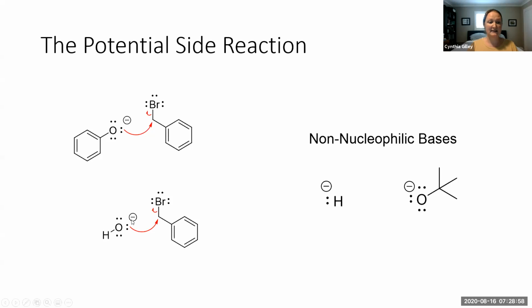So in this particular case, it's not going to be a significant side reaction, but had you added a lot of excess hydroxide, it potentially could be a side reaction, because the Williamson ether reaction itself is a slow reaction. So if it's slow, that means that the benzyl bromide won't be immediately consumed in the reaction. It will be present, and if you have excess hydroxide, it would also be present. And we know these two can react together in an SN2 reaction.